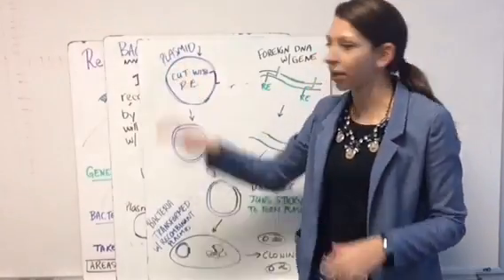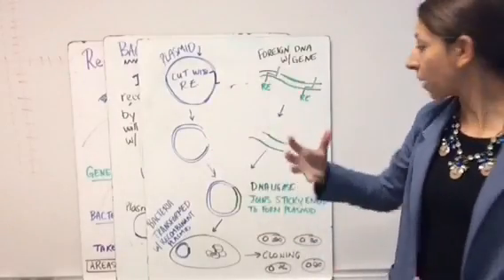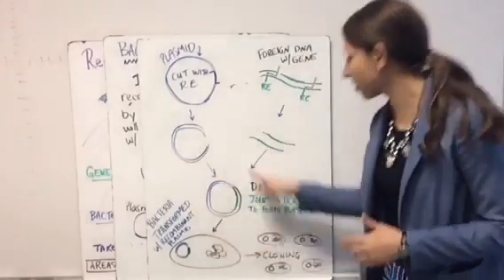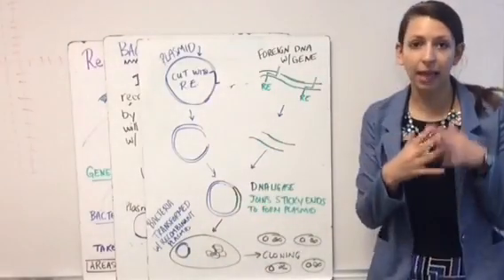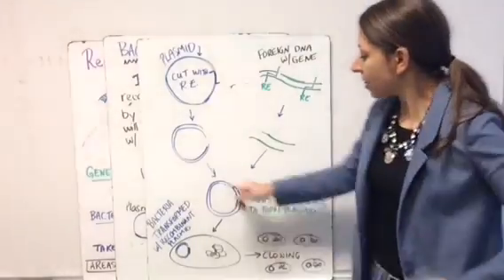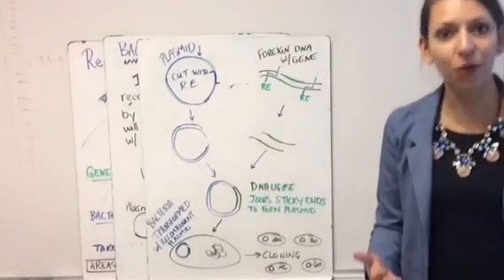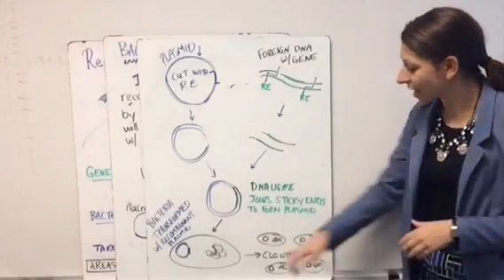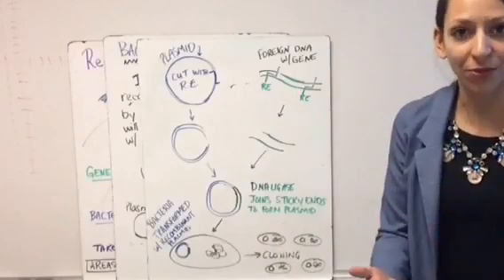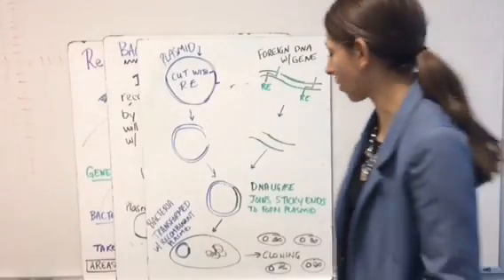And then we have our plasmid over here, our naturally occurring plasmid, that we will also cut with restriction enzymes. And then that itself will have basically a spot for this new DNA to come in and have our sticky ends so that these will easily bind, and then we have this transformed plasmid. So DNA ligase, another special enzyme, is going to join our sticky ends together to form this new plasmid. Now we're going to put it into our bacteria. Hopefully it'll get transformed. And then we'll have our bacteria that's transformed with the recombinant plasmid. And then, like I said, hopefully, if all goes well, cloning will occur and the bacteria will reproduce with the recombinant plasmid and produce that gene and create those proteins that we want. And hopefully it'll glow. Yay!